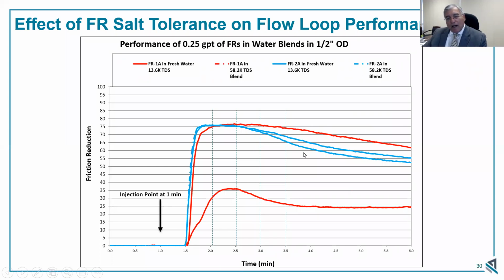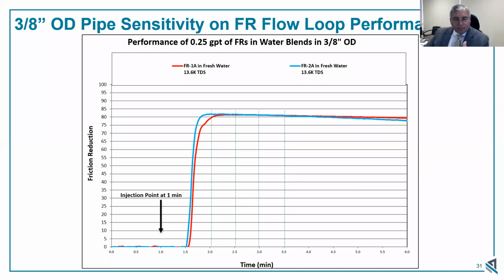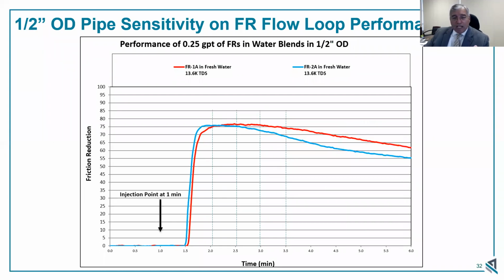Again, in the 1/2 inch, the main thing I want to make here is that we're seeing more degradation in one curve versus the other. That is another characteristic that we look at when comparing the 3/8 to the 1/2 inch: do we see degradation in the 1/2 inch after it goes to the 3/8? Here's a particular case, again, very good in the 3/8, but then we start seeing separation due to shear effects.